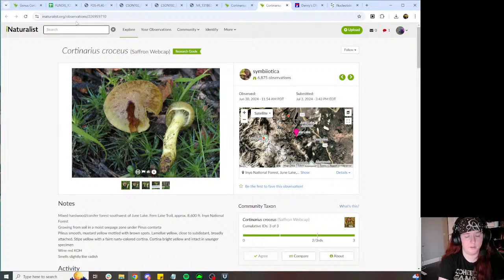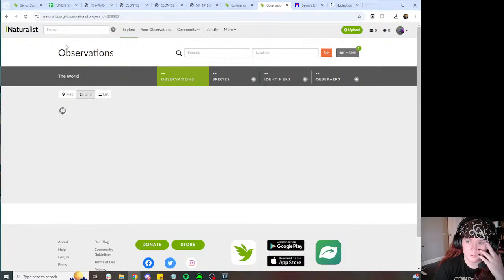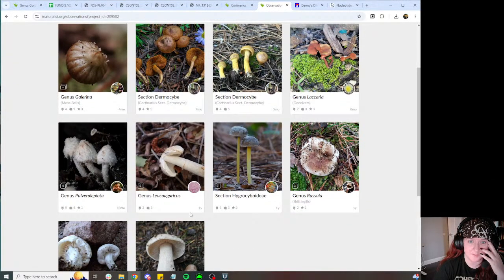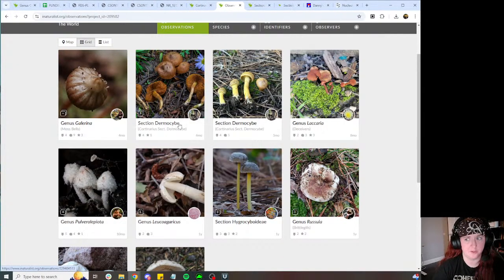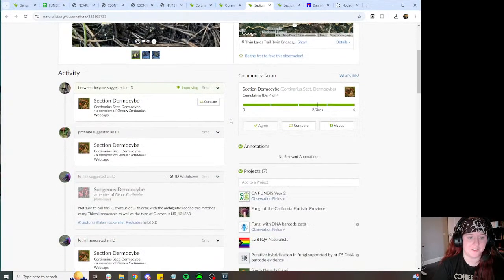We basically have this project going that's all the ones we found so far that are questionable. Like the haplotypes are different enough that we're like, what's going on here? Again, I'm not trying to say this is for sure a hybrid. It's just something's up. Someone should look into it.